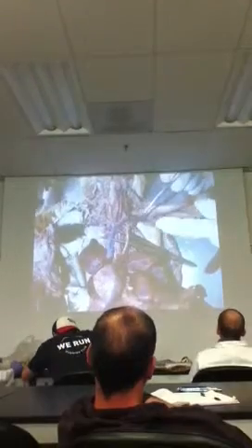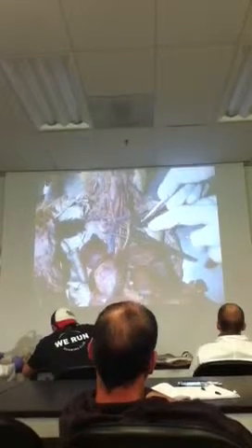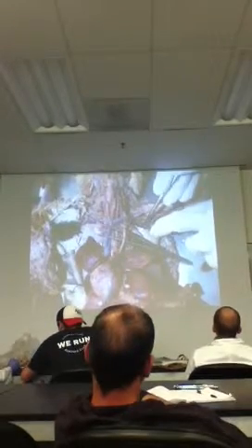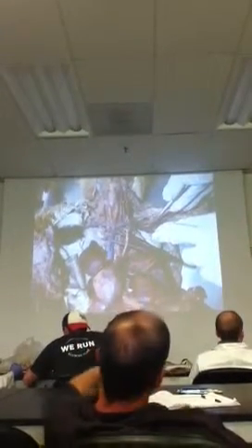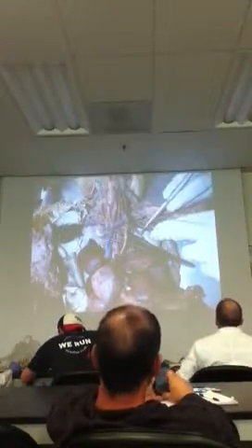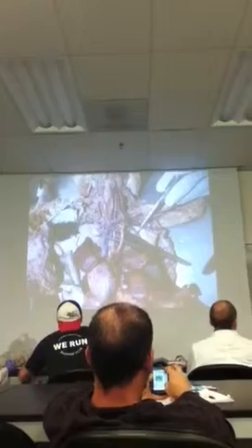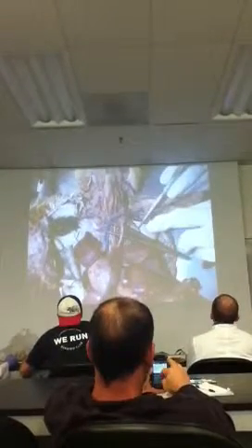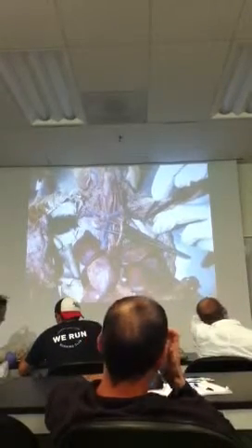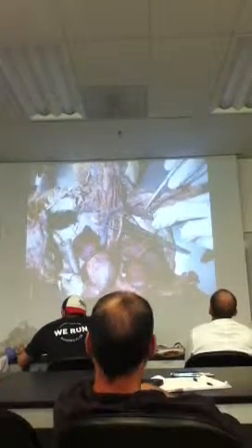There is one tiny branch of the subclavian artery that goes toward the subscapularis muscle. That's tiny as this one. In my cat, that has been caught, but in many other cats, you can see that it's this size and goes deeply into the muscle. You won't miss that when you see it, right? The same exact size.